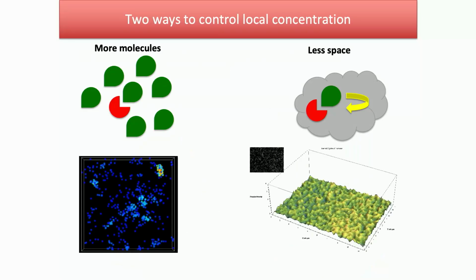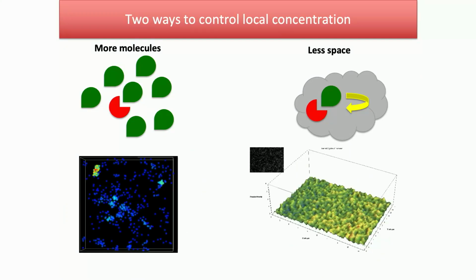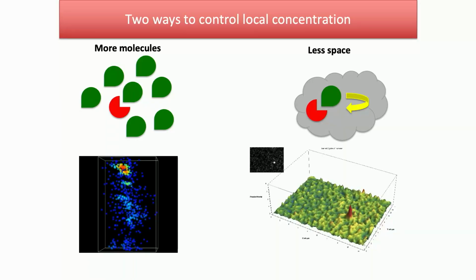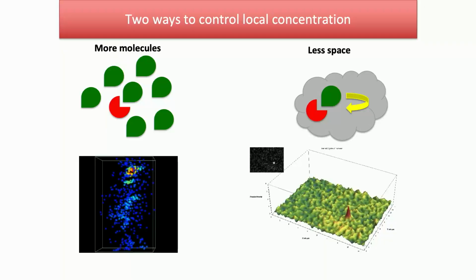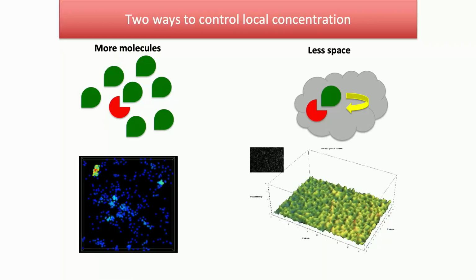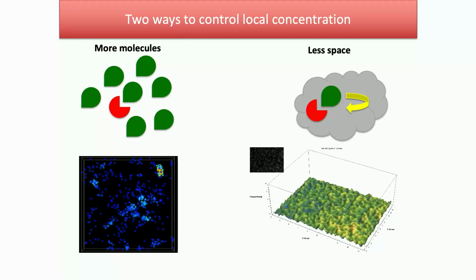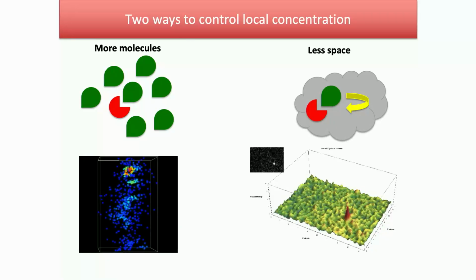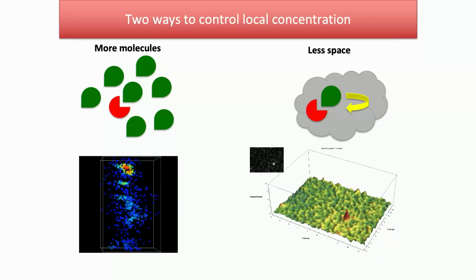And how do you bind often? There are different strategies that we have seen over the years. This is an image made by Ignacio and Ibrahim when they were in the lab, where they measure the concentration of RNA-pol2, and you see these accumulations. And so, of course, if you bring more molecules locally, you are going to bind more often, and this is a way to regulate K-on.